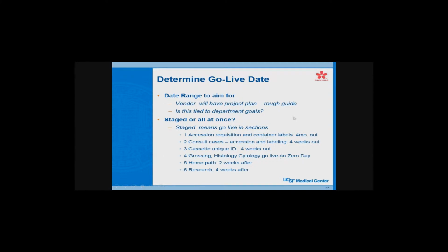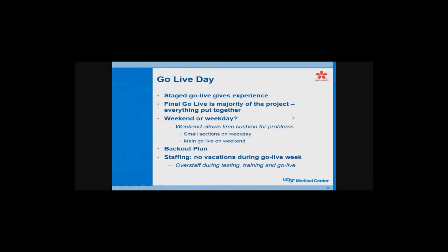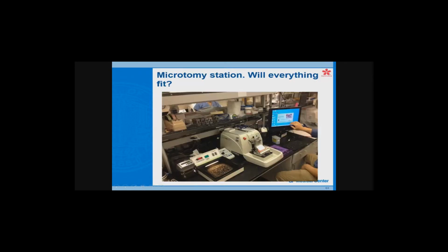Implementation, you've already got your implementation team. You've got to put in all your hardware, get all your training done. We did a staged go live, so we didn't do everything at once. We did some of the smaller things earlier, some of the smaller things later. Did histology on the main go live day.